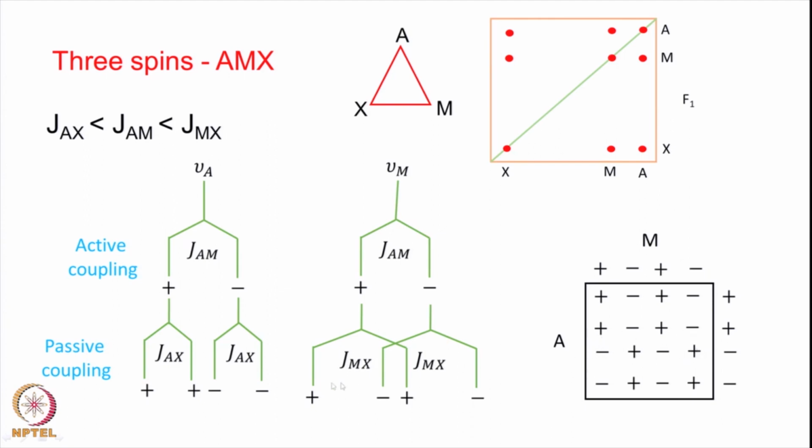Okay. Now typically, as I mentioned, you have the resolution along the F1 axis much smaller. So along this axis you will have a poorer resolution and that may result in cancellation of these cross peaks here. So often you will find that you will have this line and this line, and some of the central peaks have cancelled out, or are present only as residuals after the cancellations. So this is the kind of structure you will get for the 3 spin system in a triangular shape.